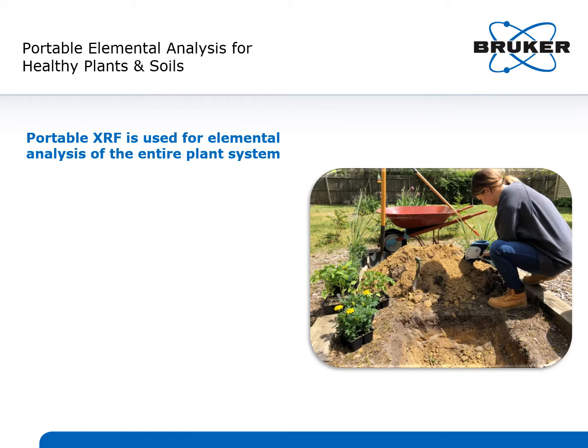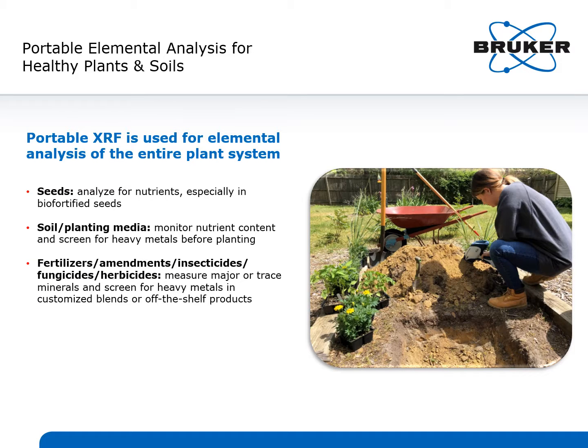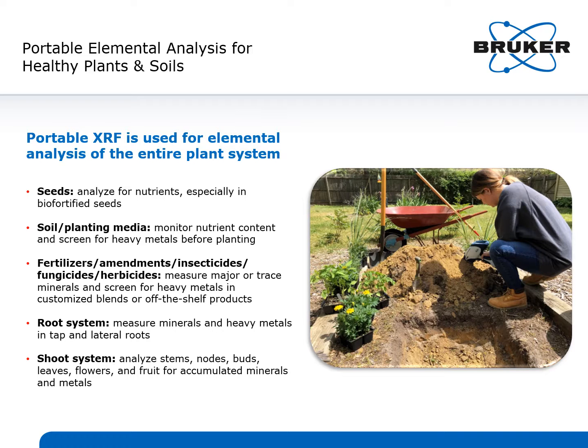We hope you enjoyed learning how portable XRF works and how some scientists are using it to analyze for nutrients in seeds, monitor nutrients and heavy metals in soil, measure major and trace minerals in fertilizers, as well as screen them for heavy metal contaminants, determine mineral accumulation from the root system, and analyze plant tissue for nutrients and heavy metals.